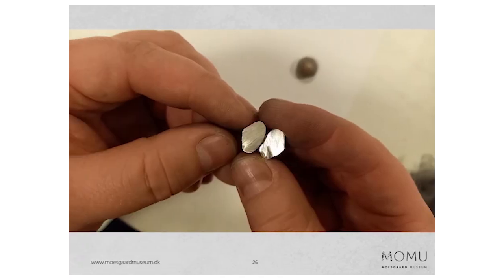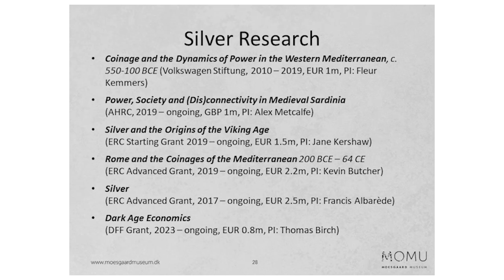So this is something that's come out of Alex's project as well. And this is a practice run. We still need to do mixing of actual dirhams that we have permission to do. And that's silver that's melted in a crucible from other silvers. So it will be really interesting to follow this up as a methodological consideration.